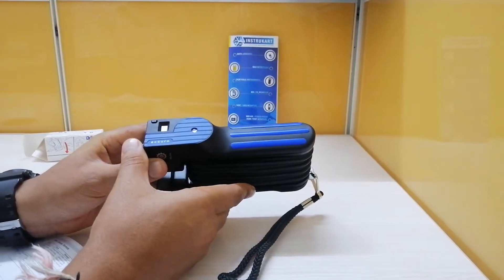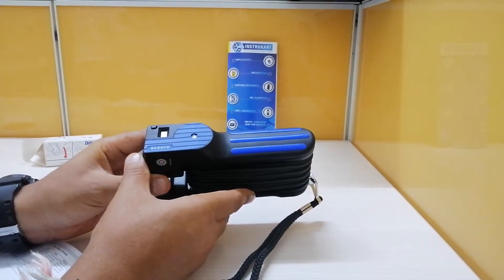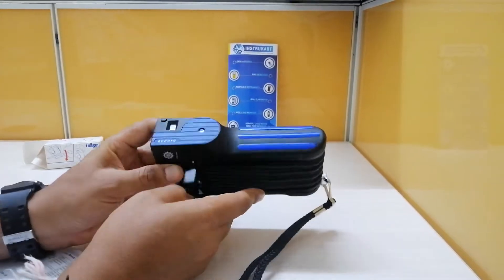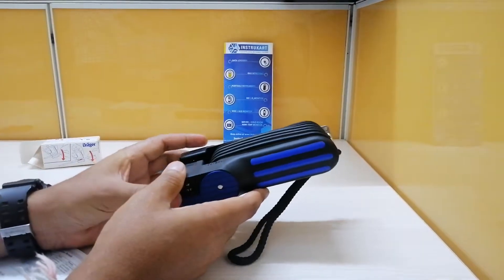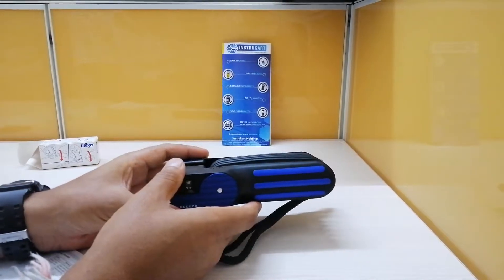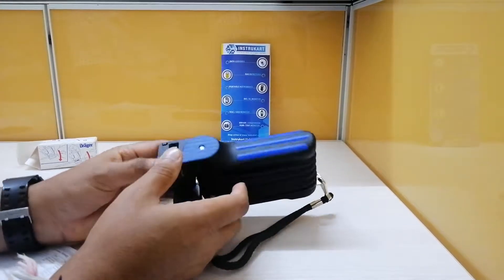Hello and welcome to InstruCart Holdings, your worldwide instrument partner. We have a pump from Draeger and this is used externally for doing the testing and to check the sampling tubes.